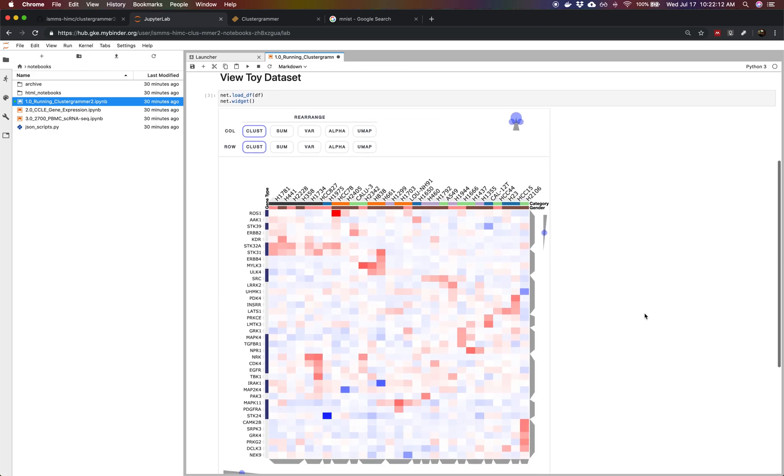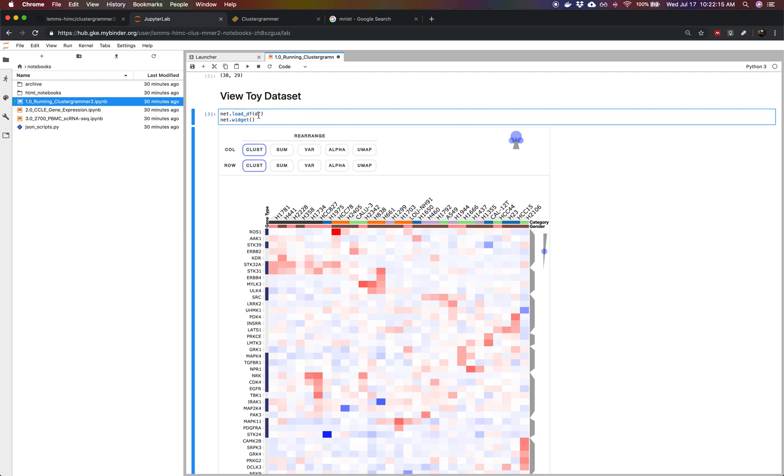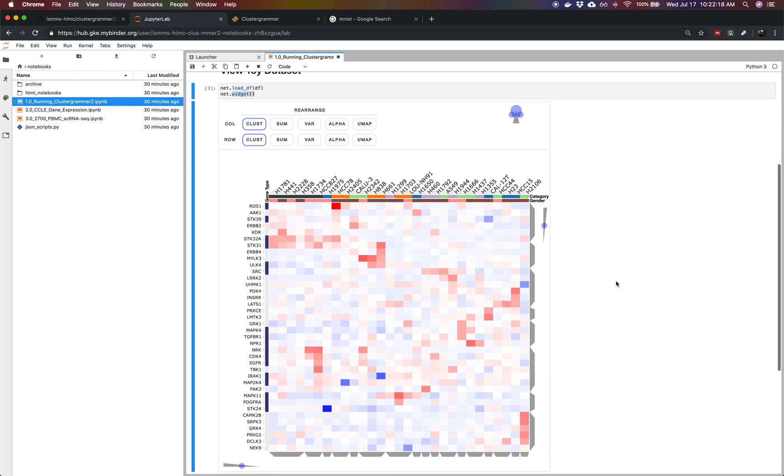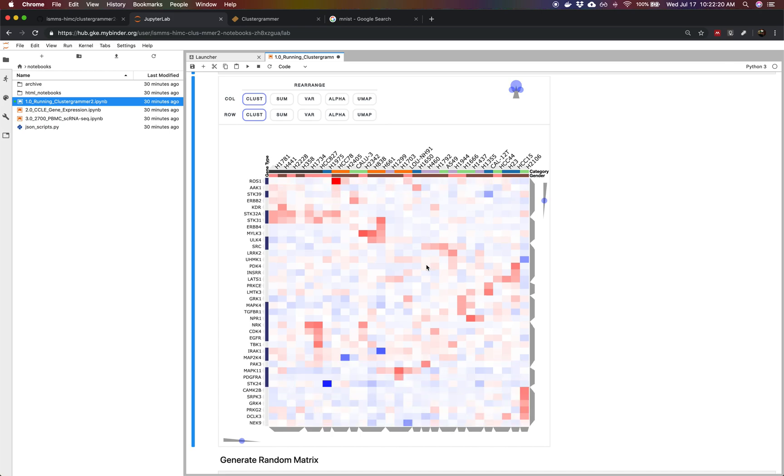Now we're visualizing the dataset using ClusterGrammar. We're loading the data frame and then saying generate a widget. So now we get this interactive widget. We can zoom in and out and we're looking at a small gene expression dataset. We have some cancer cell lines as columns and genes as rows.